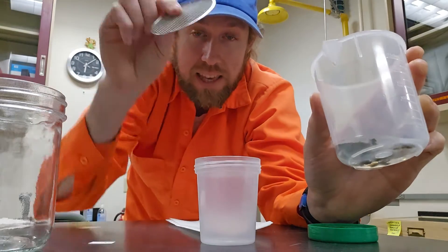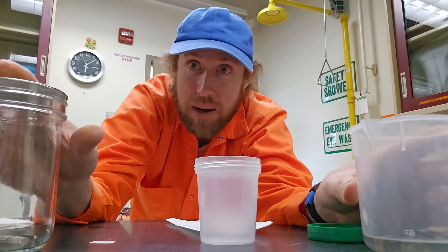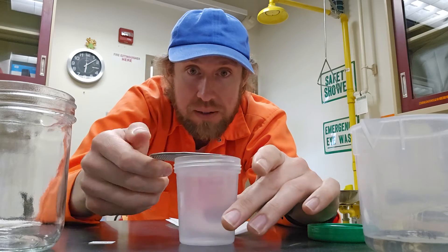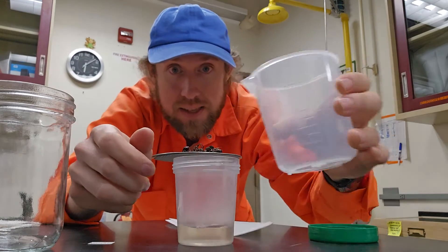The first step is to take specimens that are in alcohol and use some kind of screen — this is a mesh screen that goes on top of a mason jar. Any screen that can catch all the specimens is good. We just need to sieve those out so we have our bees like this.